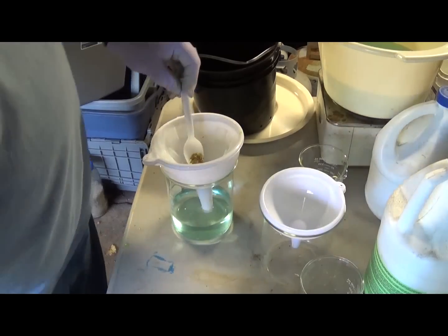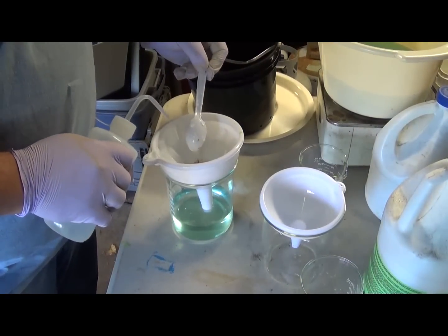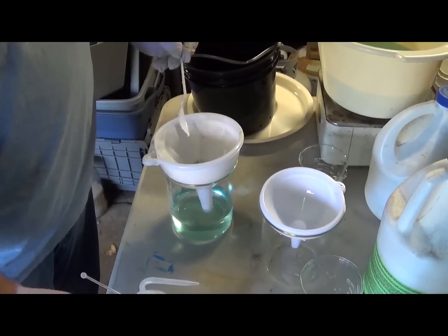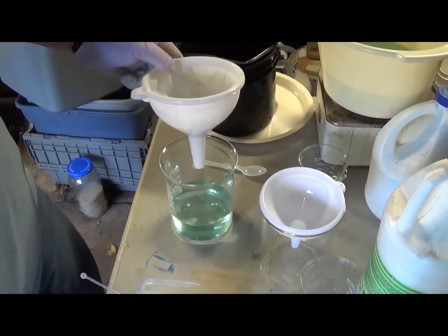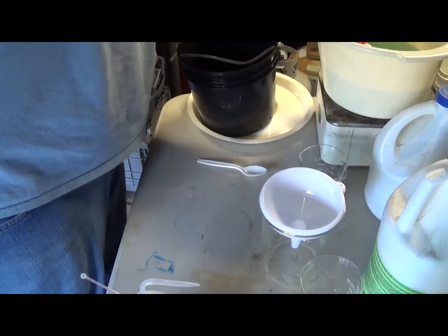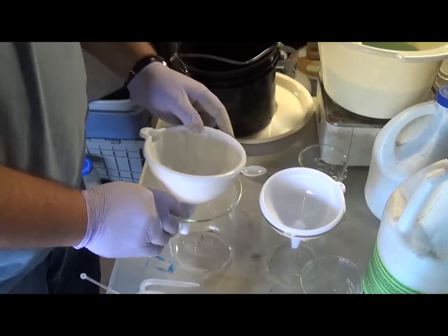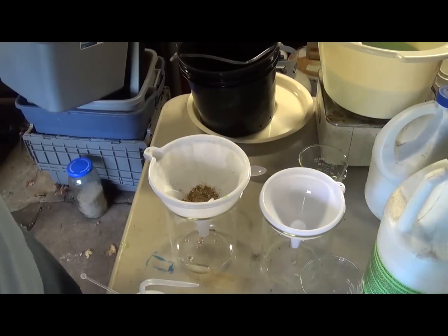The bucket is now clean. I'm going to rinse off my spoon. Double-check your solution and make sure no foils have slipped through — that looks clean. That's quite a bit of foils there. I can feel the weight — and granted it's wet, so it's hard to really gauge it, but there's going to be a few grams there.